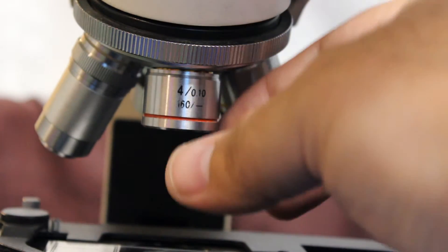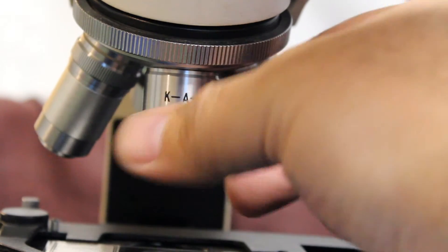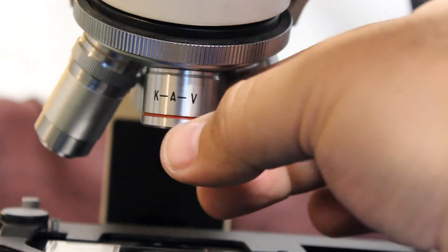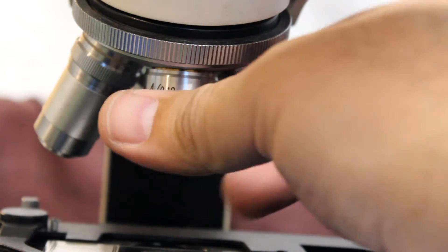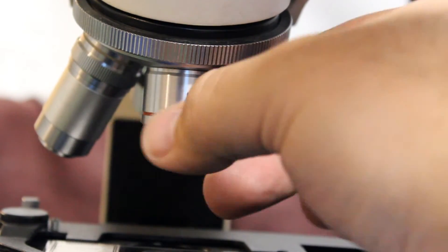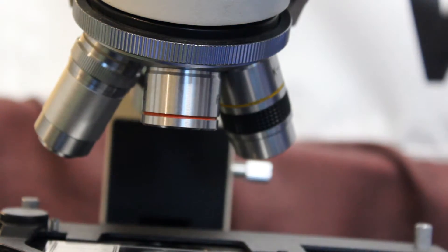This is a DIN objective. It won't always say DIN or D-I-N on it but you'll notice that nowhere on the objective does it say plan or P or semi plan or SP. Typically these are not marked or they'll say Achromat, but if it's a plan objective it'll say plan.